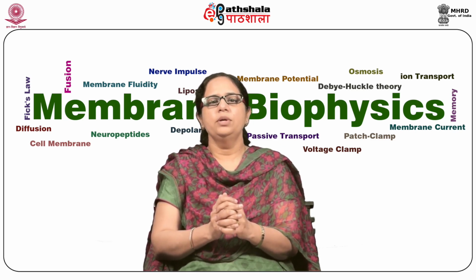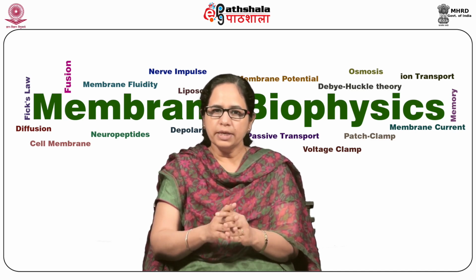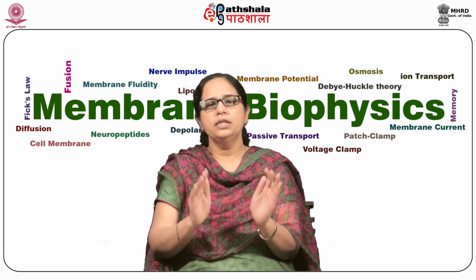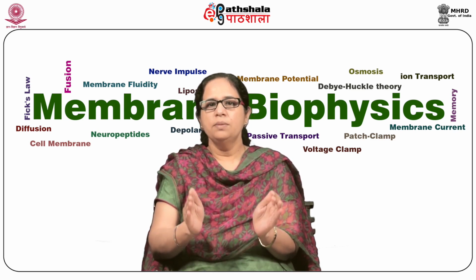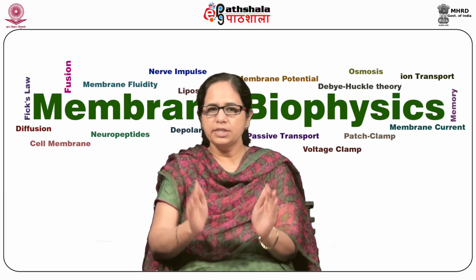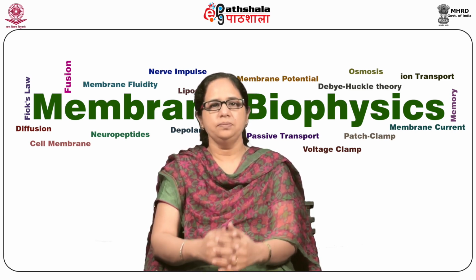It is among the few techniques that allow protein to be detected at the single molecule level, and the measurement contains much information on the heterogeneity of channel conformations and their dynamic properties.